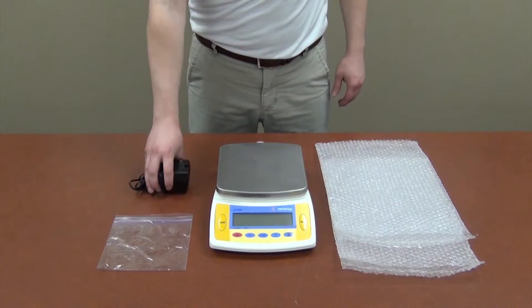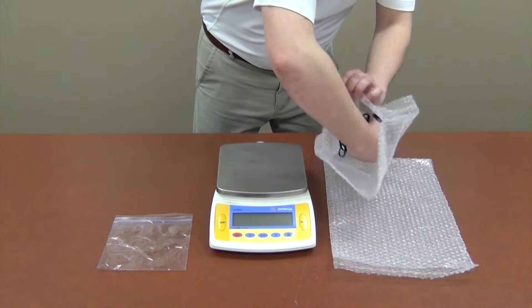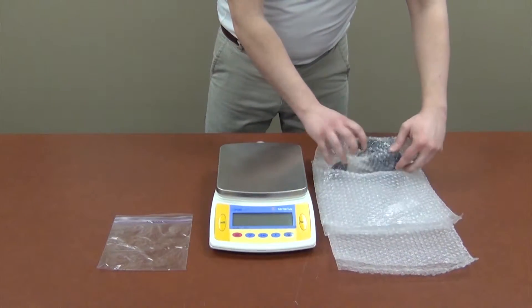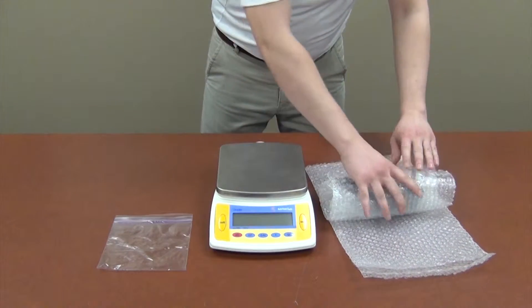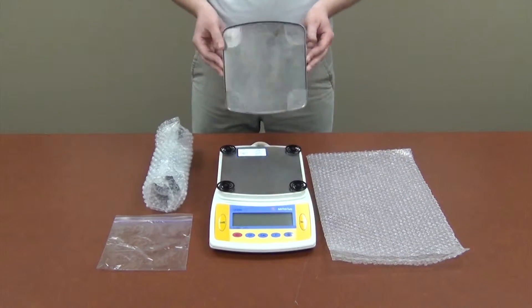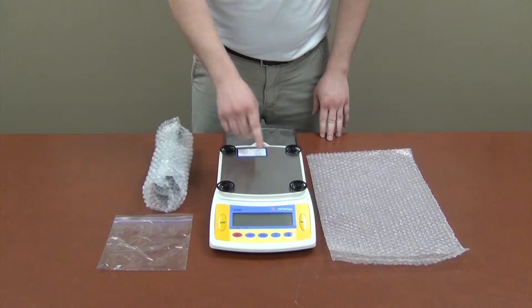To begin, bundle your scale's power adapter and wrap it in a bubble wrap pouch. Look for any supports or spacers under the pan and remove them as well.